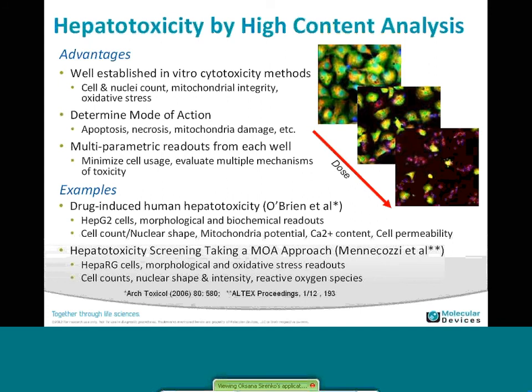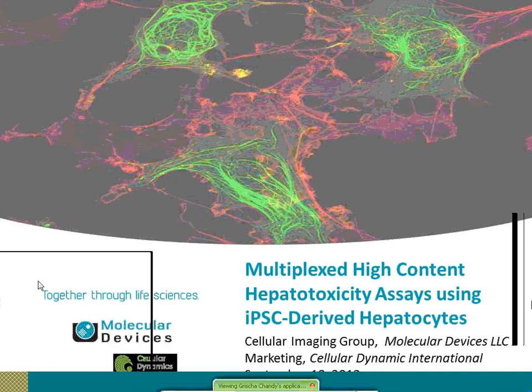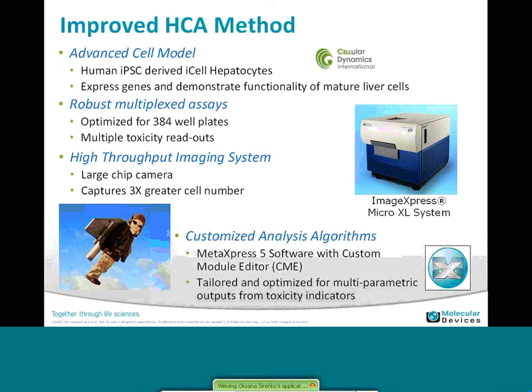There are some other publications in this field using the same or different cell models and also looking at multiplexed morphological and oxidative stress readouts.